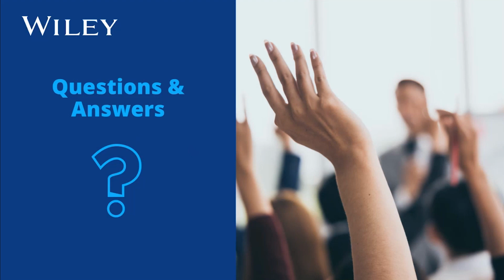Thank you, Michelle. We may have time for maybe one or two more here. Let's see. Is it possible to do an IR spectral HQI with your own database created in KnowItAll? Yes, you can do that.